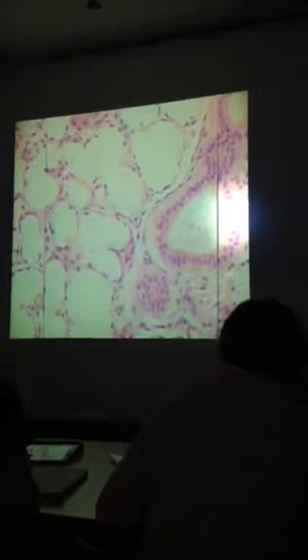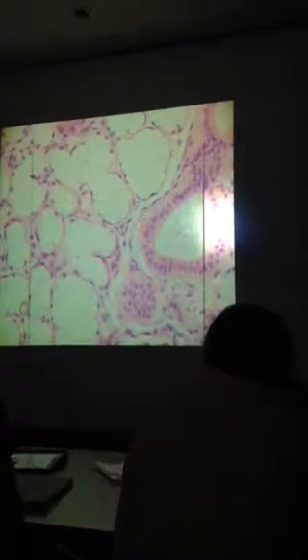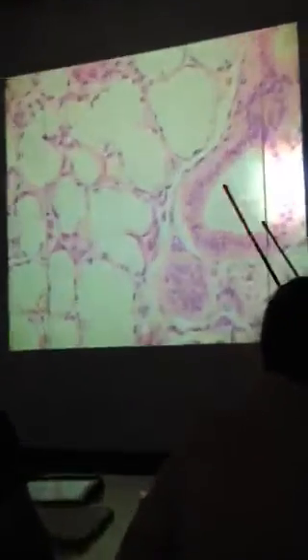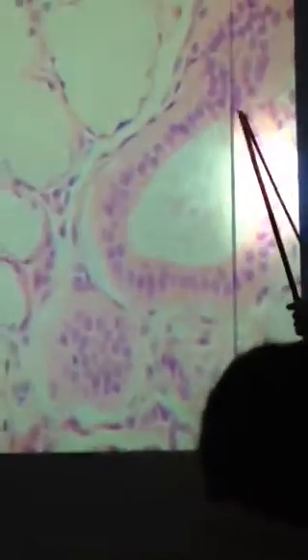All right, this one's kind of hard. I would take a rather generic answer for this one. What is this? It's the sublingual gland, right. It's actually, I would have just taken salivary gland. These are mucus secreting acini of the sublingual gland. And you can see here's a duct right here. It's kind of leading out. It's kind of weird how it kind of crisscrosses.